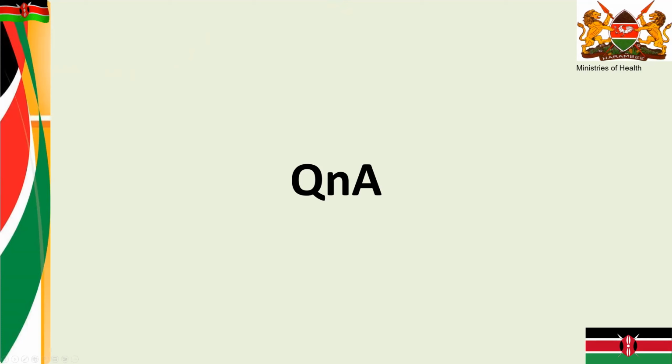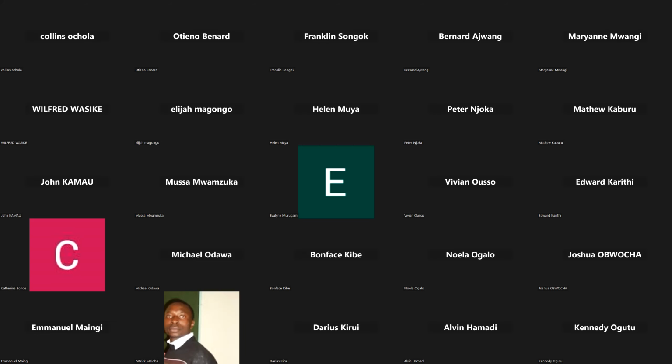Thank you, Otieno. As I put up my screen, kindly confirm I'm audible, and also my screen is visible when I put it up. My name is Marianne Mwangi. I'm going to take us through this particular session for a practical overview of Kenya EMR using the lab manifest feature.